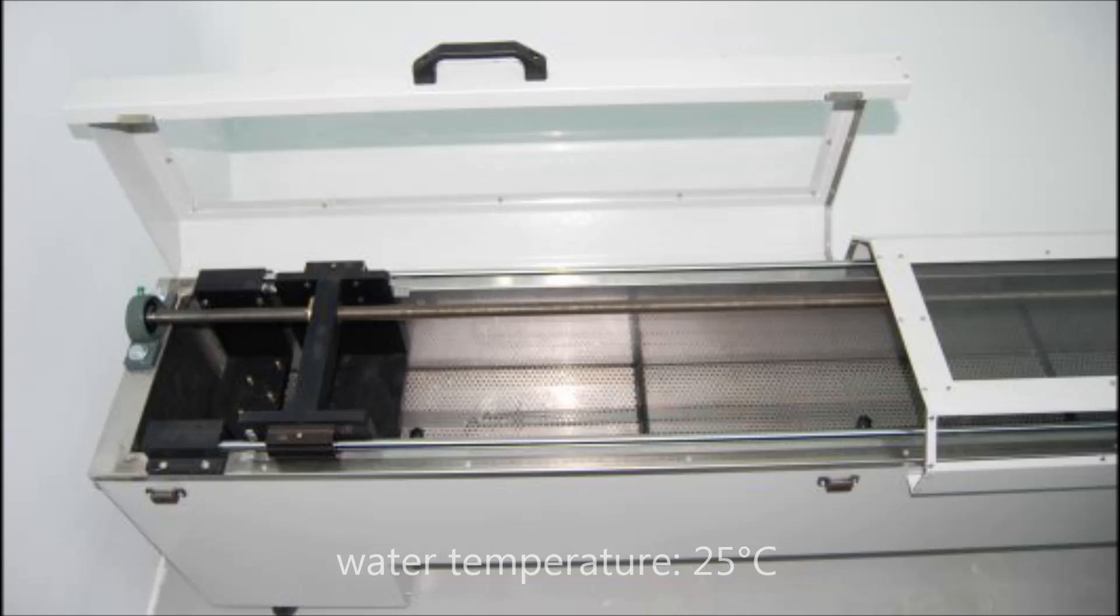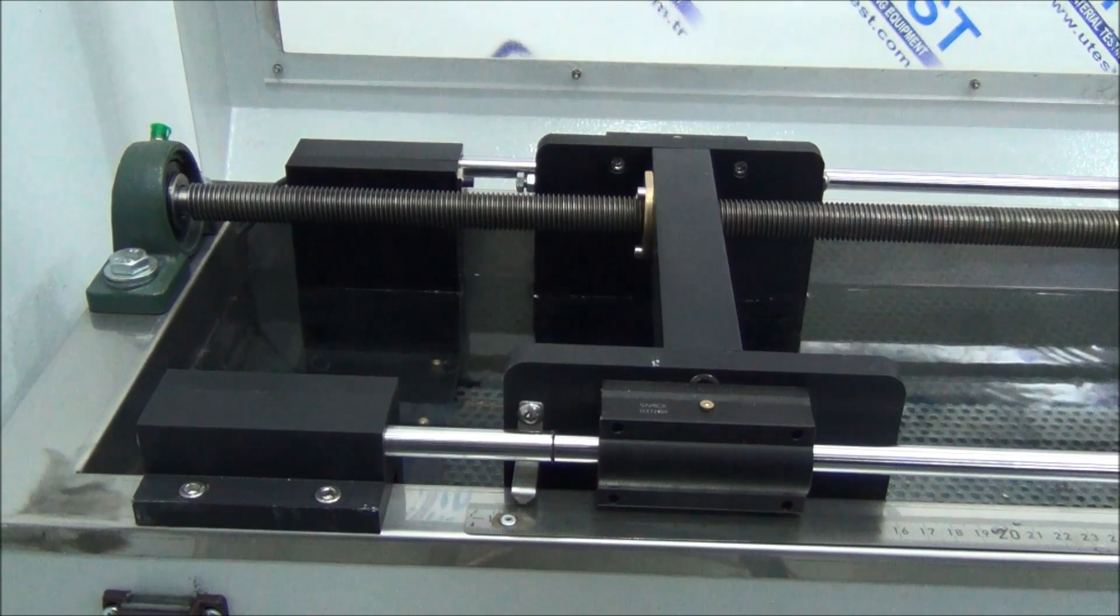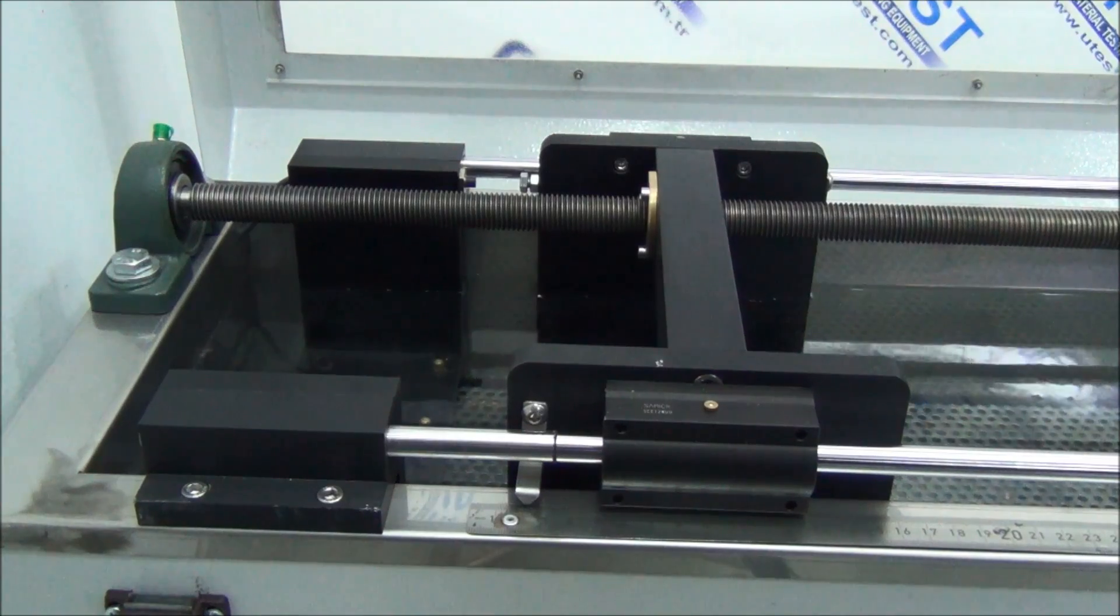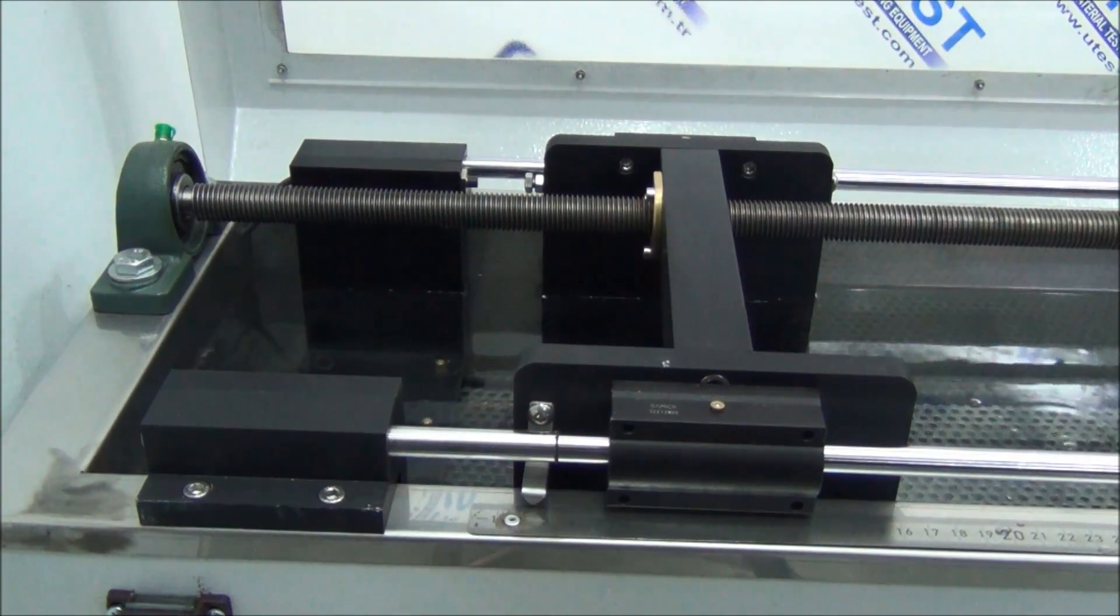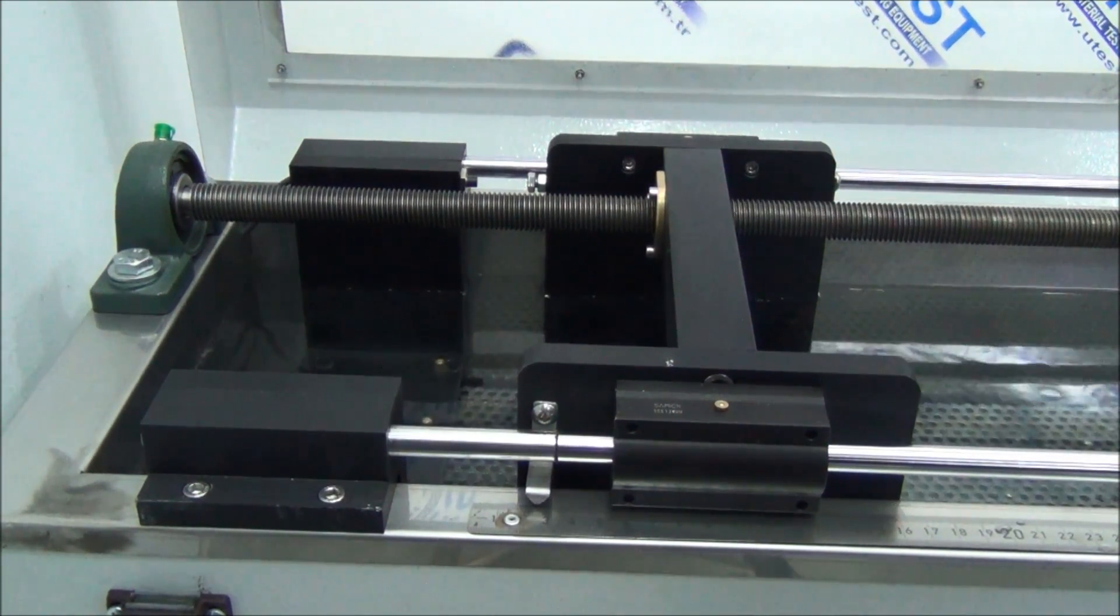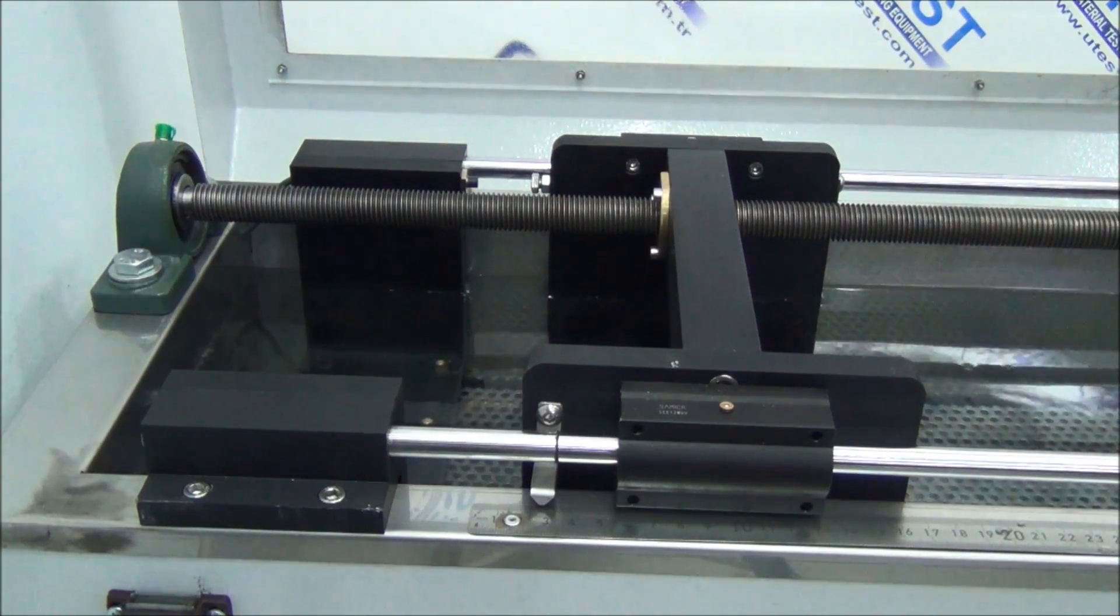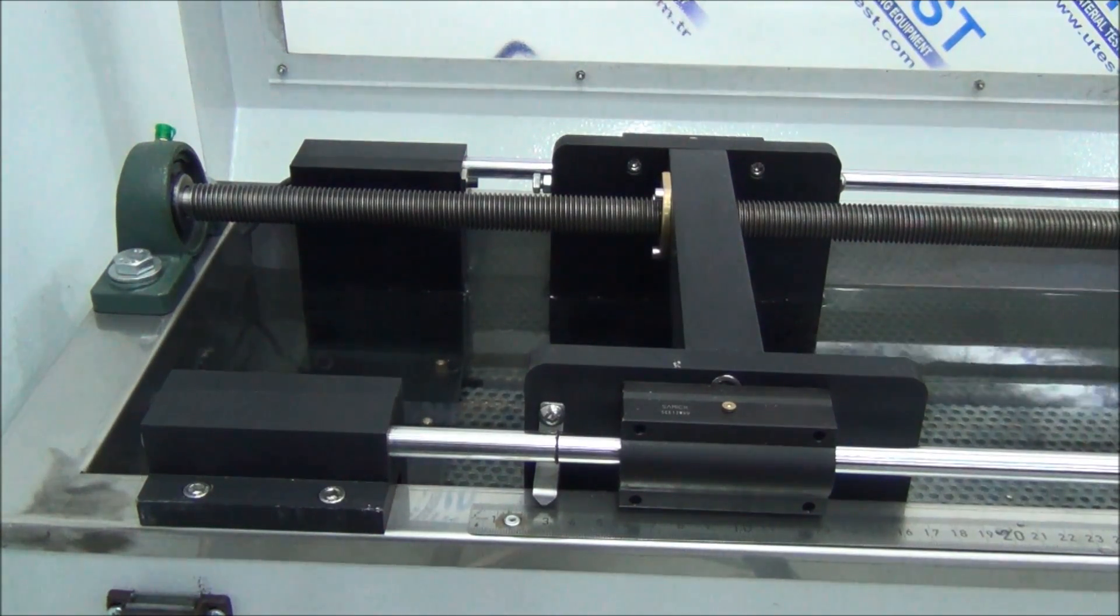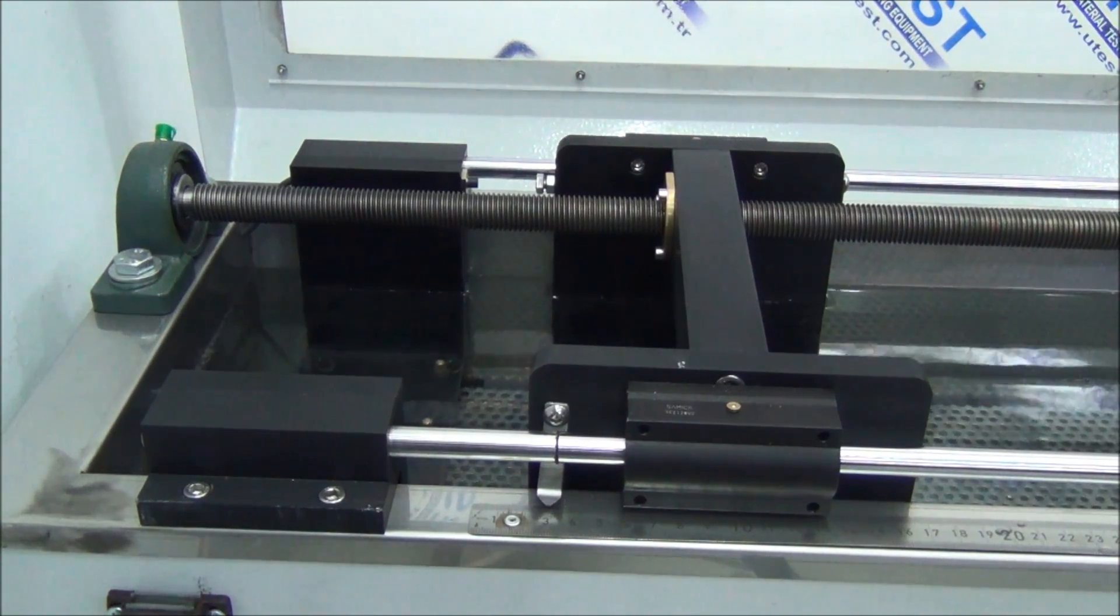It is designed for testing three specimens simultaneously. The internal tank is made of stainless steel. The bath is fitted with an immersion heater in order to obtain the 25 Celsius test temperature.